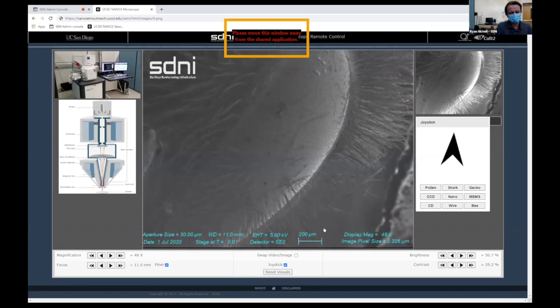It looks like there's shadowing, so you can't really assign brightness and darkness to different elements in this case. But Angela is 100% correct that if you choose the right type of detector, you can then assign whether or not you expect more electrons to scatter off certain regions than others. So that requires sample specific information.